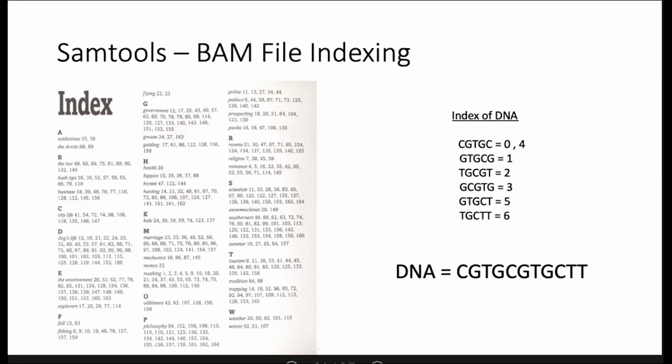Similarly, if you want to find where in the genome a string of nucleotides goes, we need to index the genome. Since DNA sequences are not words exactly, we take a certain number of bases, which is known as a k-mer, where k is the number of bases taken. So in this example, we are going to index with 5 bases. These are known as 5-mers.